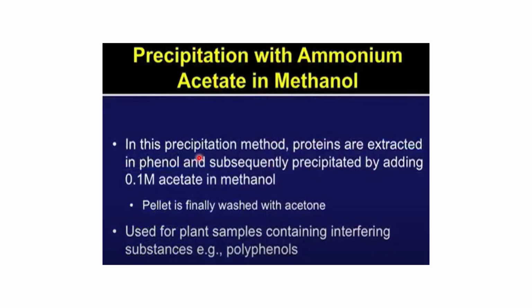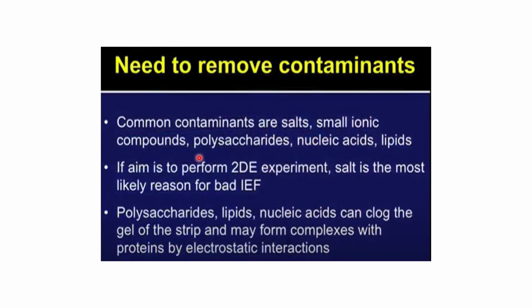Depending upon the type of protein you want to get precipitated, different methods can be applied, and a maximum amount of protein can get precipitated. So it will be concentrated also, and analyzing those concentrated proteins would be much easier, and a much less sensitive technique can be used because your protein is concentrated. If it is not, it will be present in very minimal concentration, and then you need to use a very specific, sensitive technique to analyze those proteins. So that's what it helps in terms of doing protein precipitation.